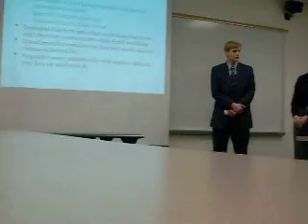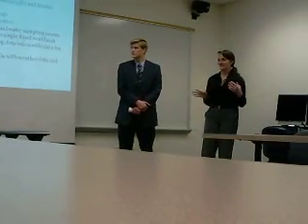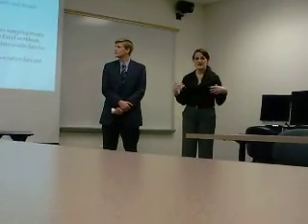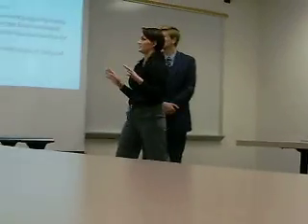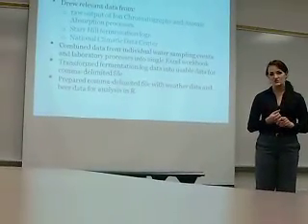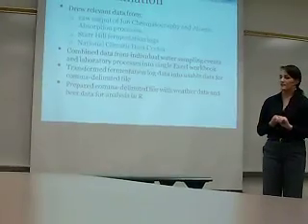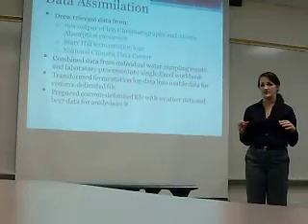So out of our little motley crew, I'm the number cruncher data type person. I did a lot of the data analysis. And a part of the data analysis that really tends to get put behind the scenes is the actual data assimilation. But because it was so extensive in our project, we really wanted to bring it to the forefront. So we had data from our own water sampling, from the fermentation logs, from the NCDC website, and then the raw output from the ion chromatography and atomic absorption processes.